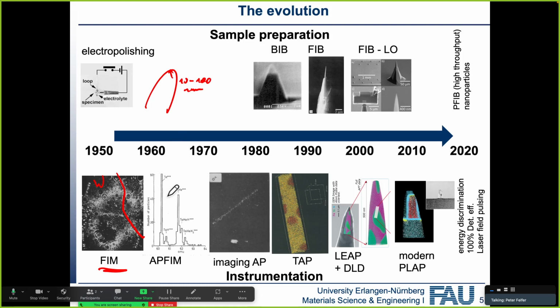Again, this was at the time when lasers had been invented, and the pulse durations in lasers were relatively long. The first lasers we see in the 80s. And from that, they just got time of flight data.